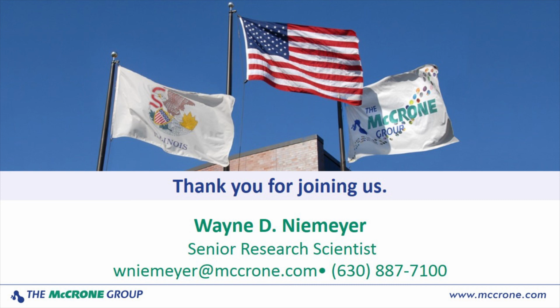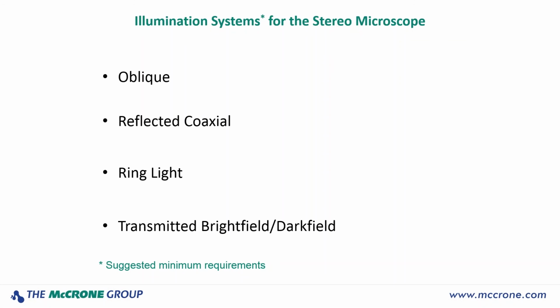Okay, Mark, he's asking if you could please refer to the slide, the basic necessities. If you want to scroll all the way back there. Yeah, I can get back to it. There it is. Okay, those are the minimum requirements. That's what I consider minimum requirements anyway. Again, there's more that you can add to a stereo microscope, but these are the ones that I use quite a bit.